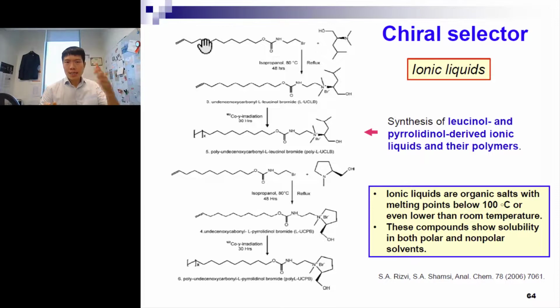And this tail is hydrophobic. So think about it: you have a tail, you have a charged part, and you have duplicates of this. If you want to harness your Coulombic attraction, you need all the charges to be together. But because of the space dispersing them, it's not really a full classical ionic structure. It's a mixture of ionic interaction and London dispersion forces.